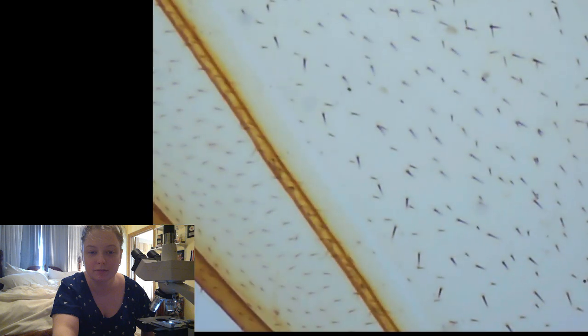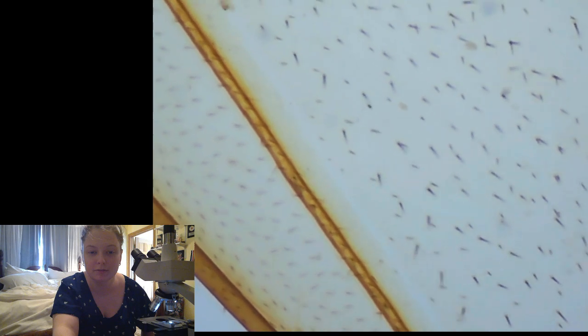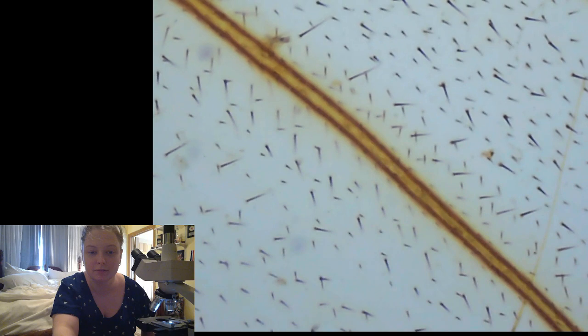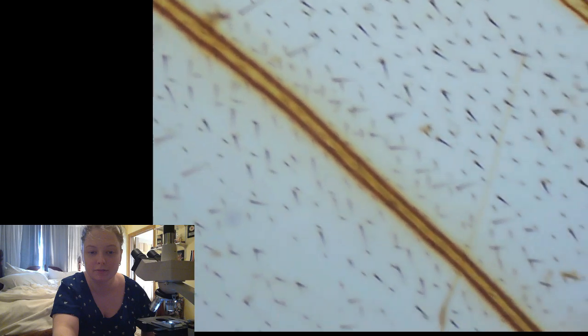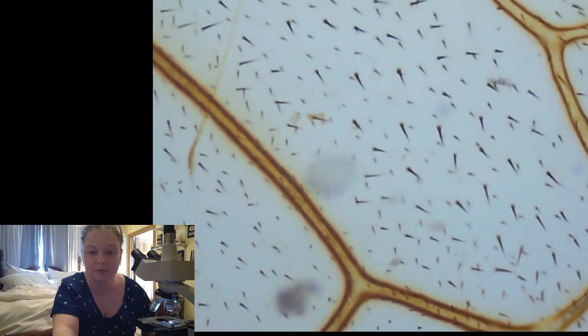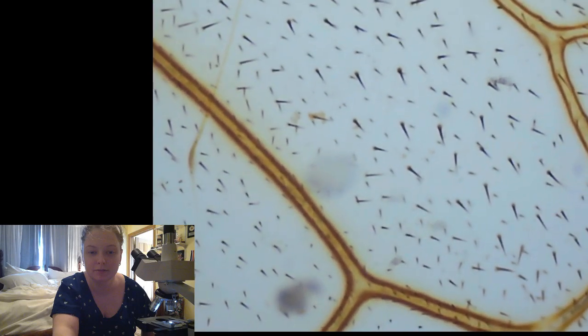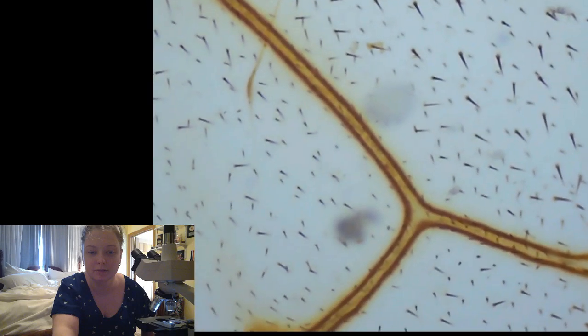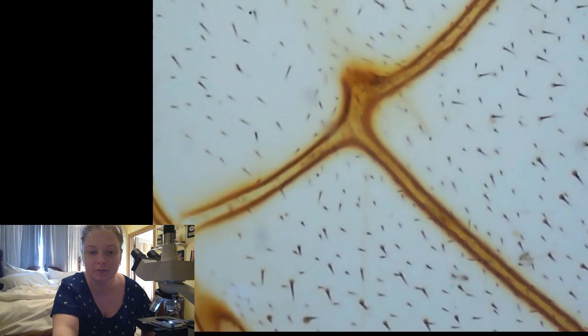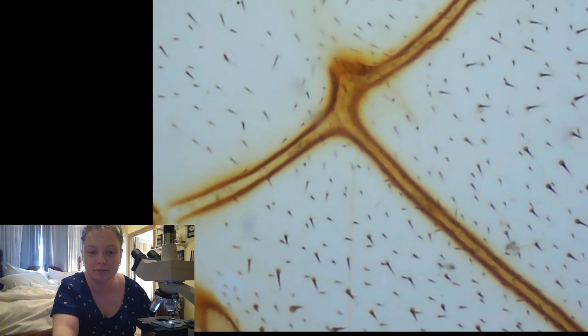Oh, this is cool because it's kind of yellow. And it has fuzz on it. Check that out. I did not realize bee wings. I wonder what kind of bee this is from. It doesn't say, it just says bee wings. It would be interesting to know what species of bee this comes from.